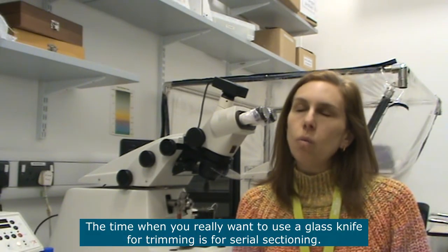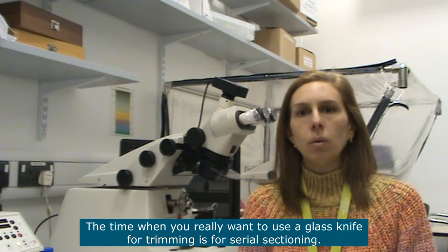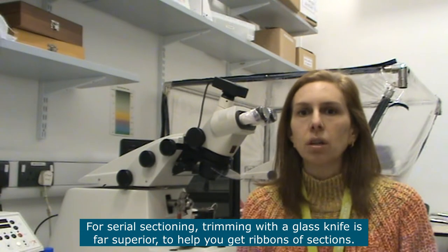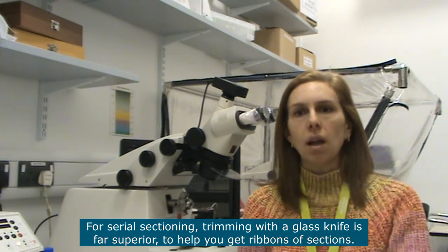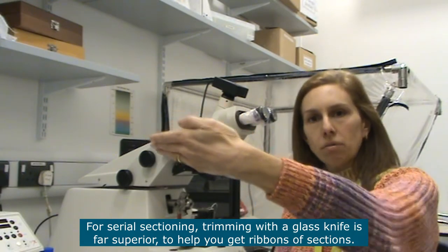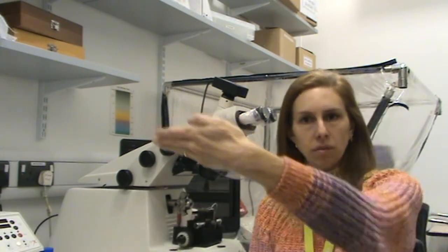The time when you really want to use a glass knife for trimming is when you want to get serial sections. For serial sectioning, trimming using a glass knife is far superior because it helps you a lot to get ribbons of sections that stick together.